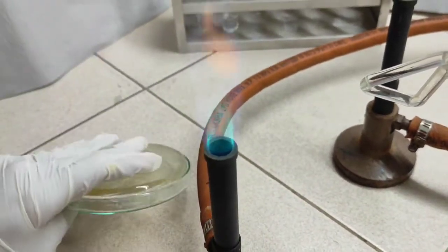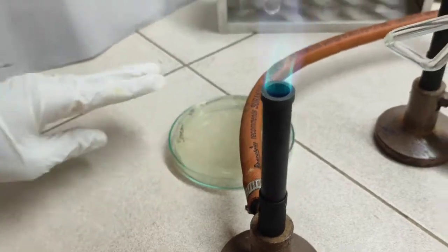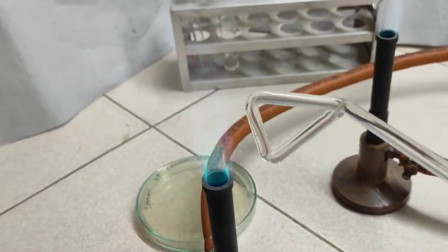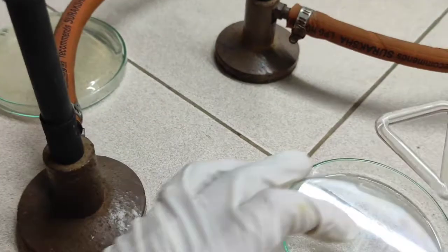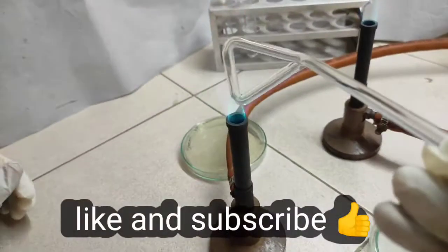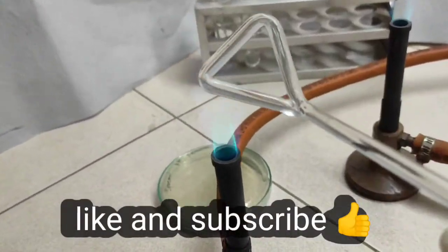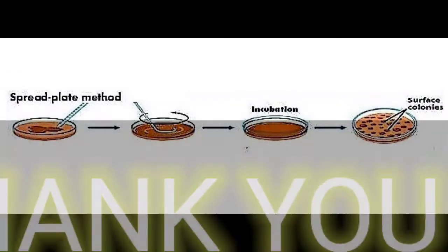Plates would be inverted before placing it in an incubator. Let's do it. Thank you.